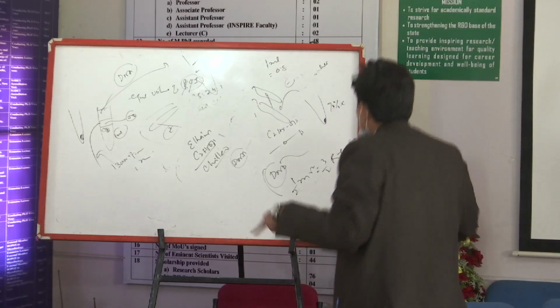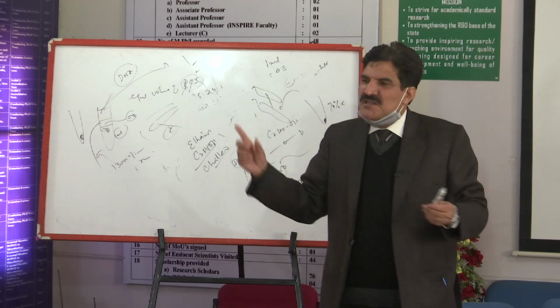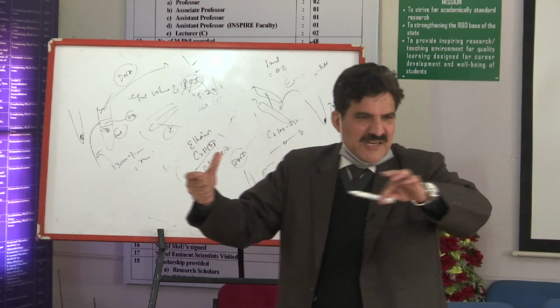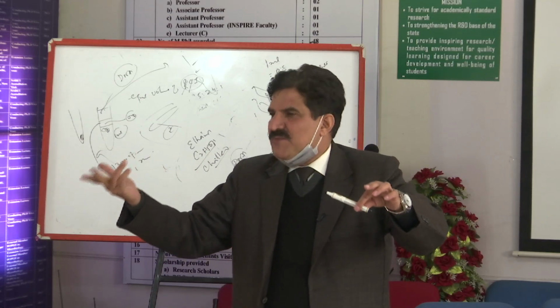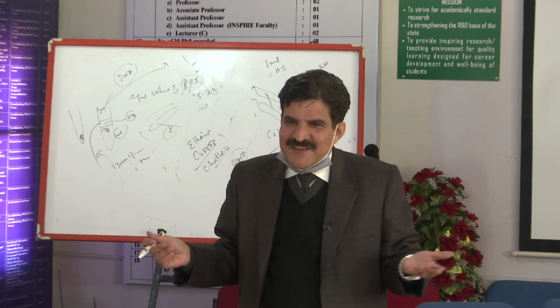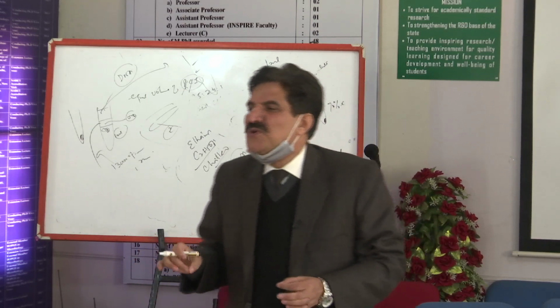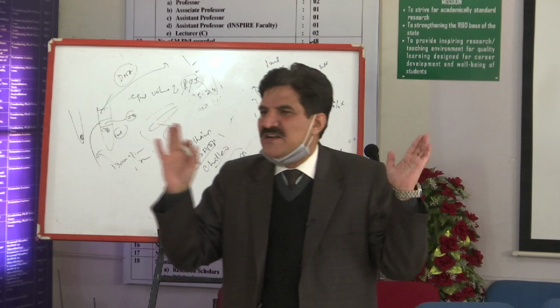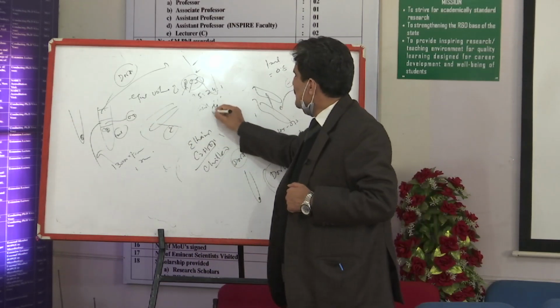And then you can wash it a number of times. Finally the DNA precipitate is at the bottom. You can take this tube, you can place it near a dryer, hair dryer. You can keep it overnight, inverted. So alcohol will be evaporated out. You can take that precipitate now. You can dissolve it in 50 to 100, 30 to 100 microliter of distilled water. Do not use just any distilled water here, special water comes, Milli-Q water.